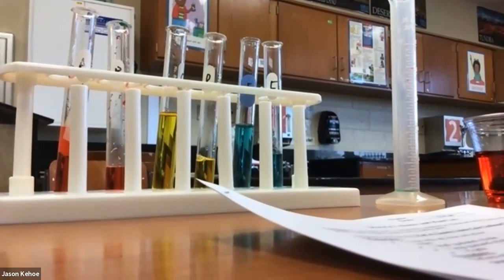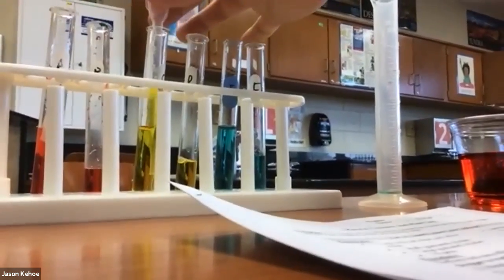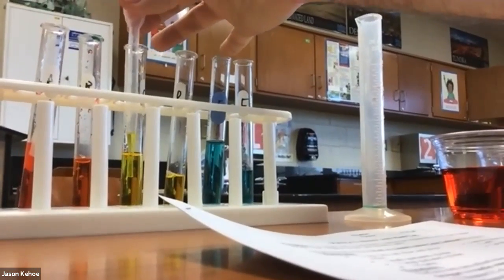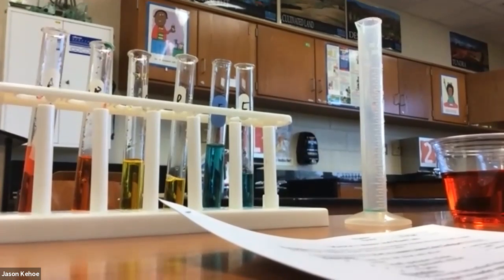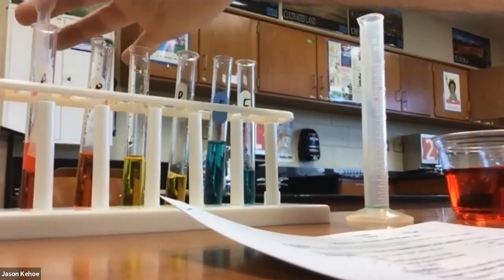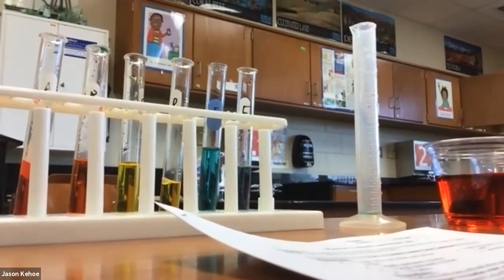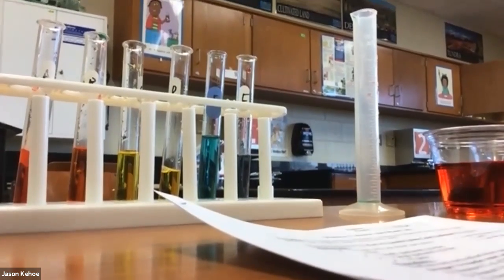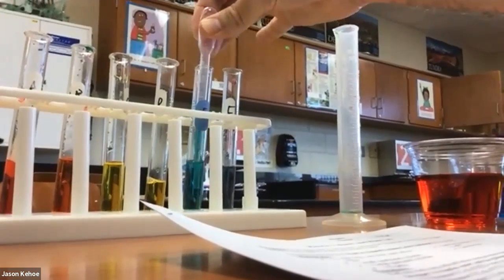Step 7, measure 2.5 from C and put it into B. Okay. 2 and a half. Step 8, 1 milliliter from A into F. Okay. 1 from A into F. And measure 2 milliliters from E and put it into D. Didn't quite get 2 that time.